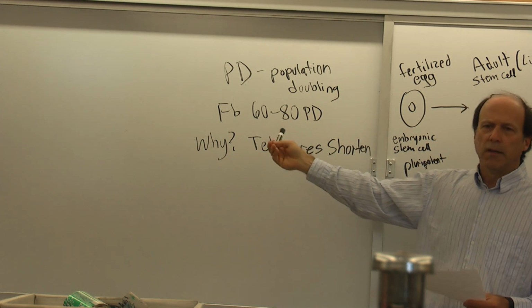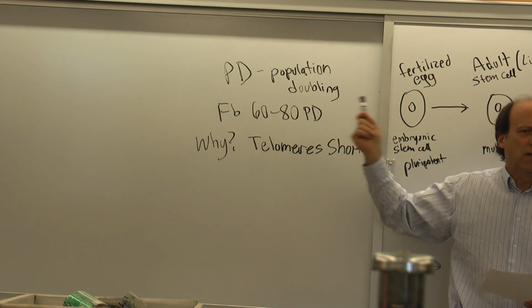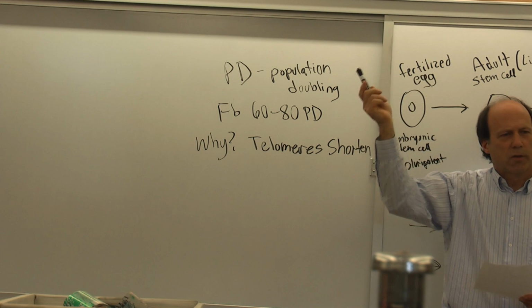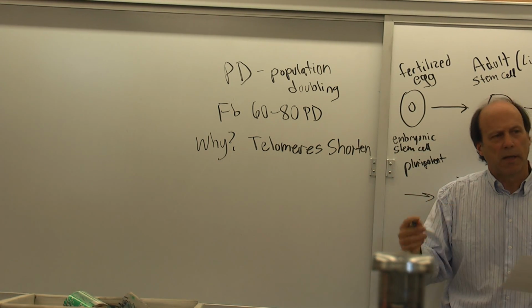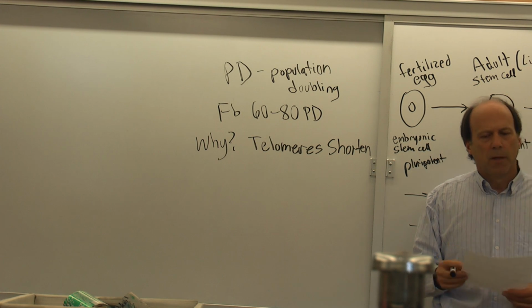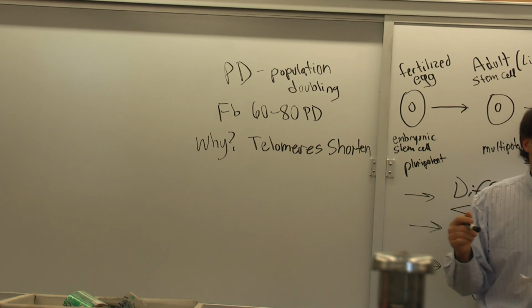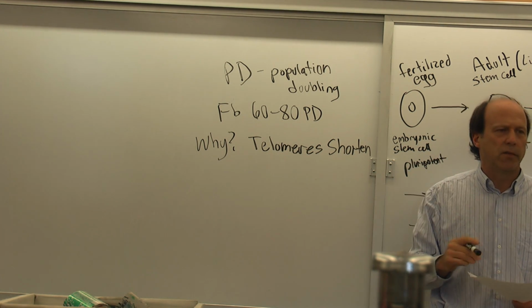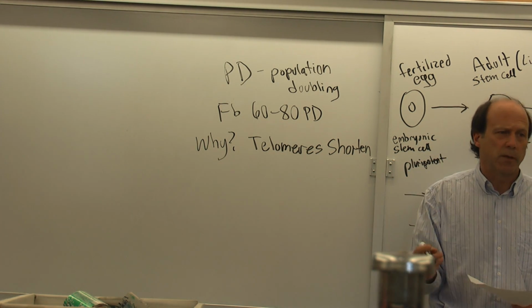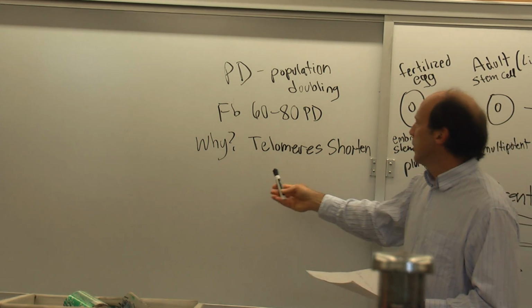One of the scientists there is really good at doing these growth curves and stuff, Dr. Judy Campisi, and we try to collaborate with her. We have the same setup as she has, actually, the same cell counter. So when you use that culture counter Z1, that's what she's using too for her population doubling measurements.